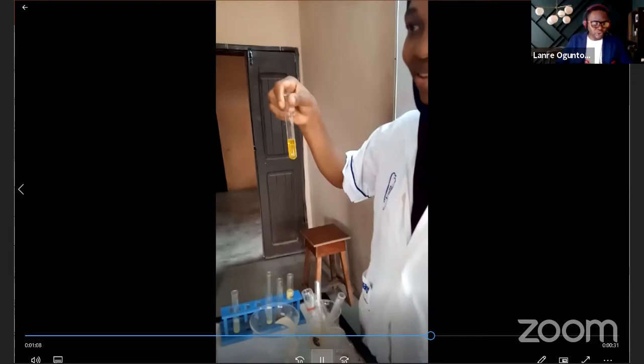Okay, so let's go straight to this. Let's say 2C quickly. Now we want to look at the solubility of sample D. So let's say sample D plus water, that is distilled water. Please take your own book and be filling too. Okay, we are doing the test now. I will be writing the test, then we'll be recalling the observation.